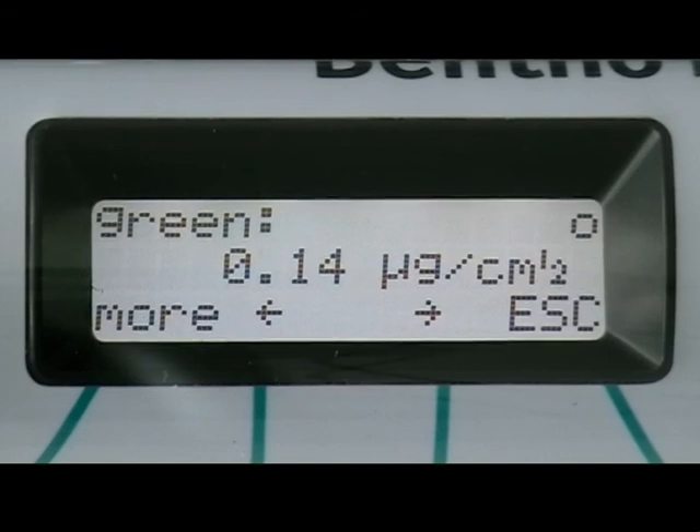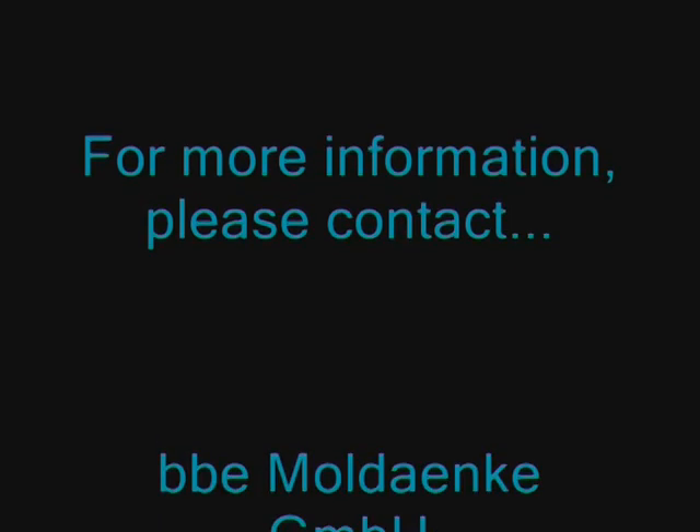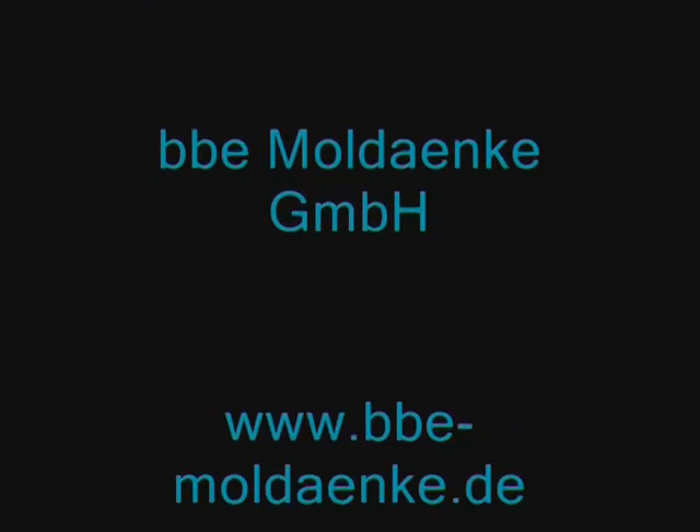Previous measurement results can be displayed by simply scrolling through the menu using the keys beneath the arrows. For more information on the algae torch, the bentho torch, or any other BBE fluorometer, please contact BBE at the following address or your local representative.